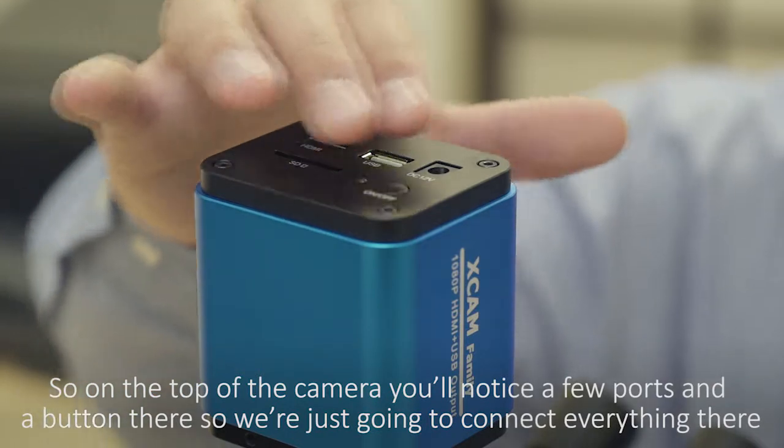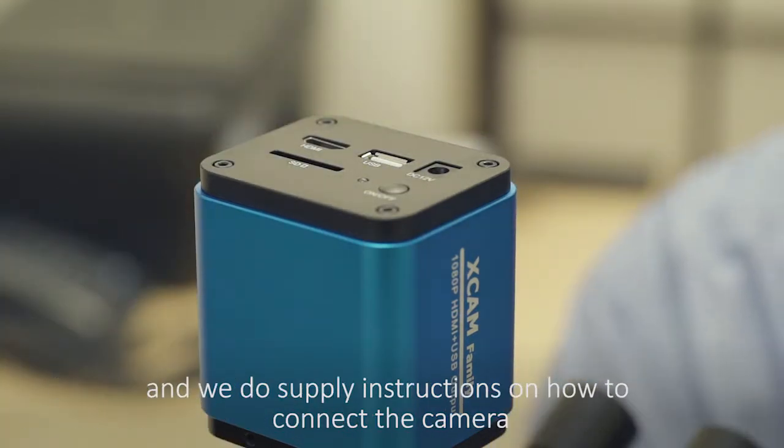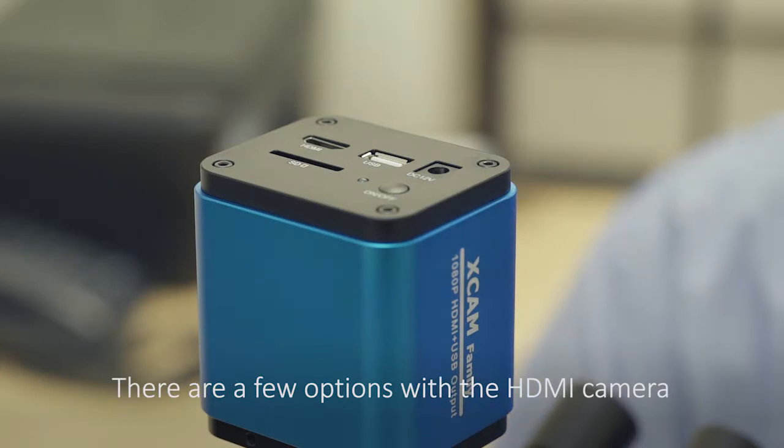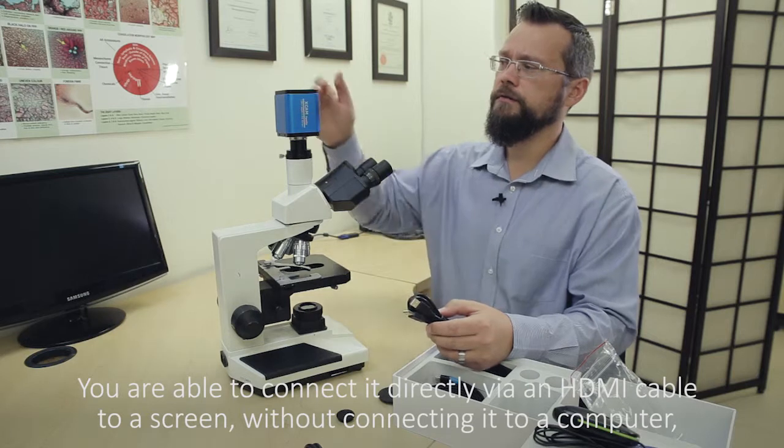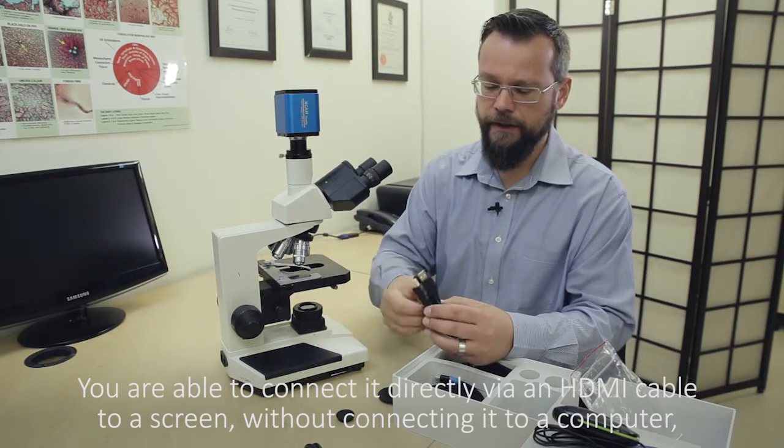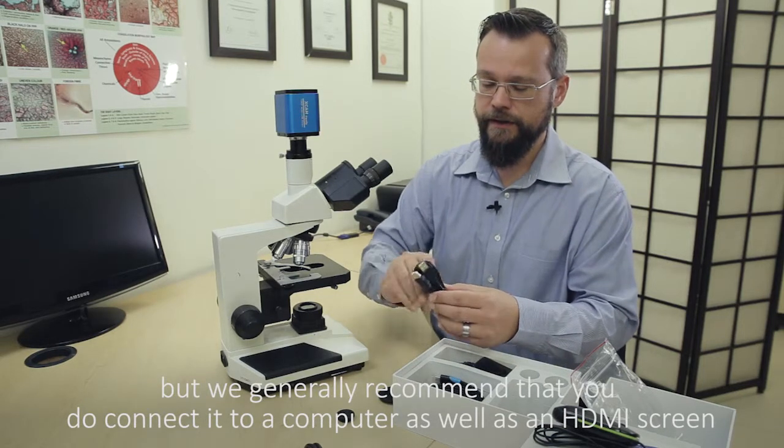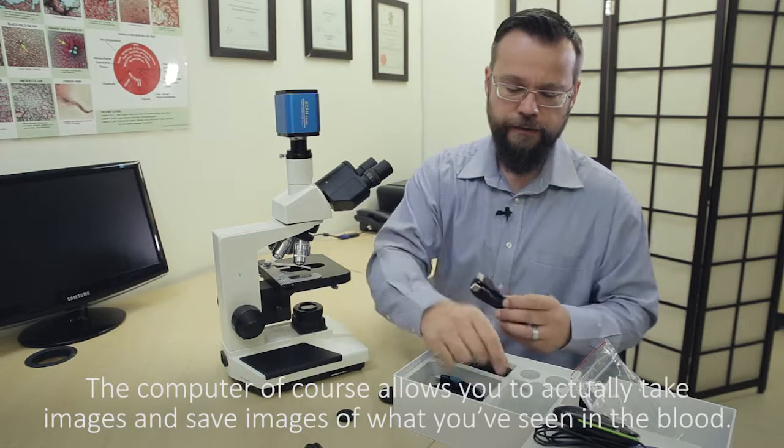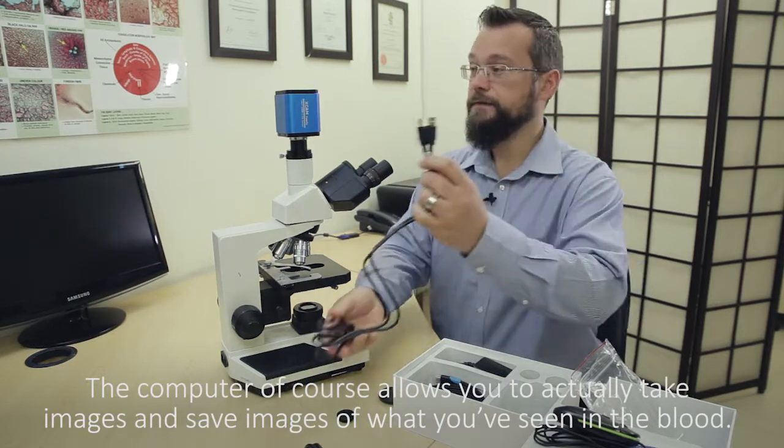So at the top of the camera you'll notice a few ports and a button there, so we're just going to connect everything there. We do supply instructions on how to connect the camera. There are a few options with the HDMI camera. You are able to connect it directly via HDMI cable to a screen without connecting it to a computer, but we generally recommend that you do connect it to a computer as well as an HDMI screen. The computer of course allows you to actually take images and save images of what you've seen in the blood.